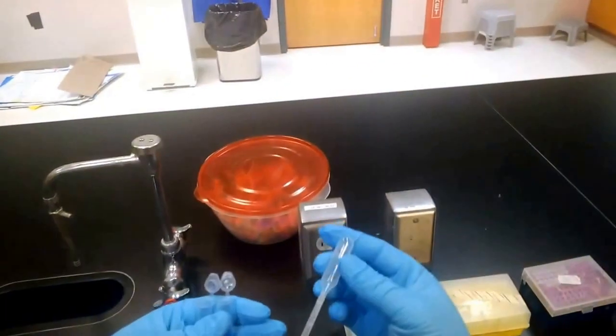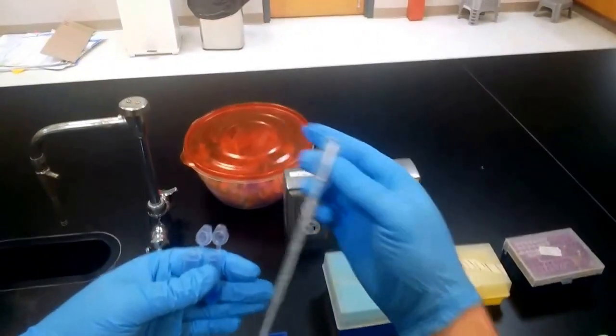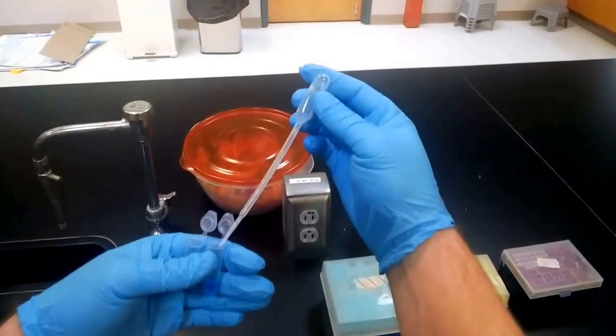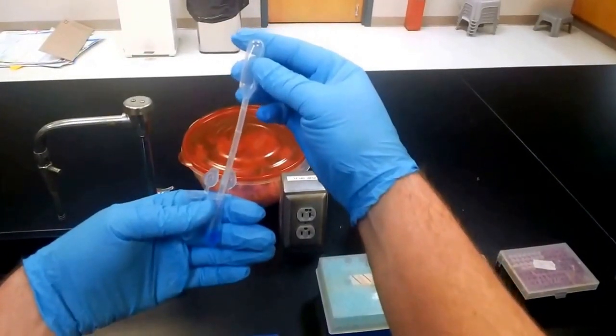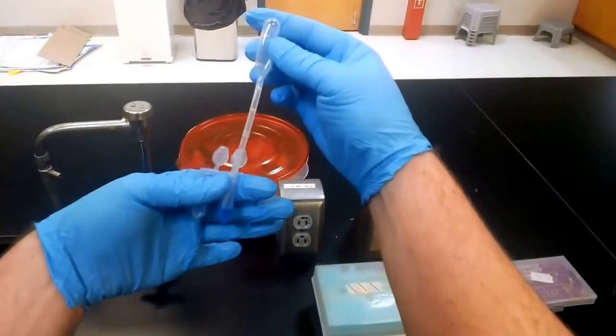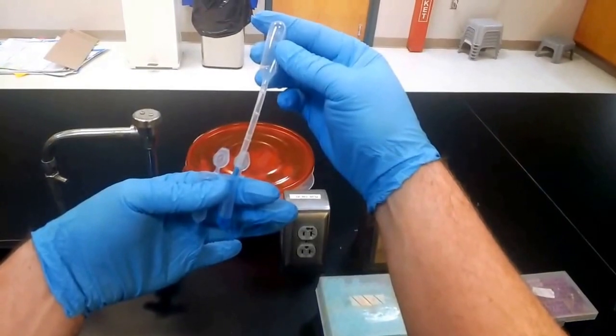So let's try to transfer, let's say, 250 microliters with the Pasteur pipette. That's certainly possible. We squeeze in the bulb of the Pasteur pipette, dip it into our solution, and then pull up slowly until we get to 250 microliters.